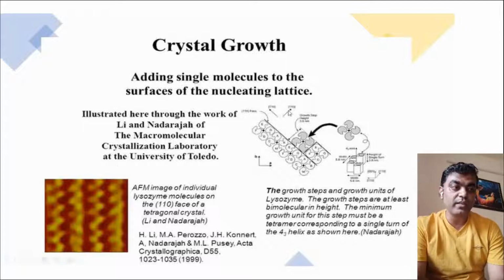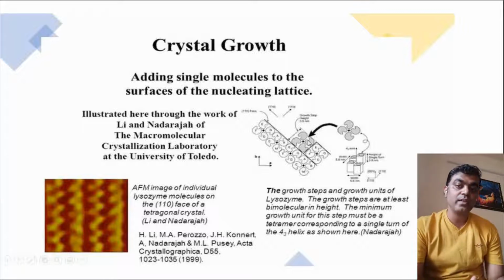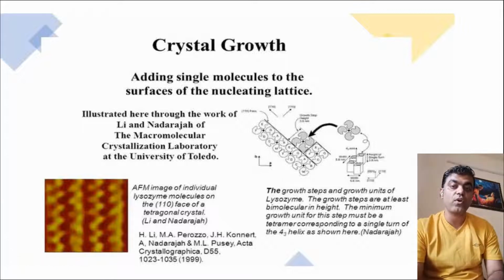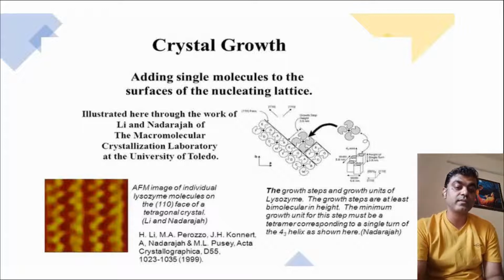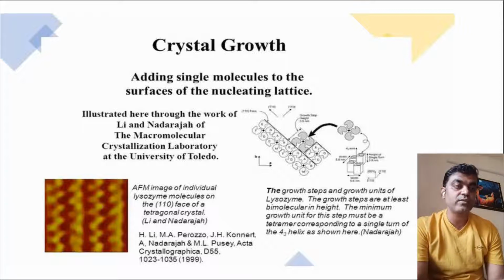The growth pattern should not change. You see here the growth pattern is uniform in all the directions, right? And this growth pattern should be uniform in all the directions, so that when the X-rays fall, the diffraction patterns can be used to study them. If the internal pattern is not uniform, then it makes no point. We cannot get information from the diffracted X-ray light.